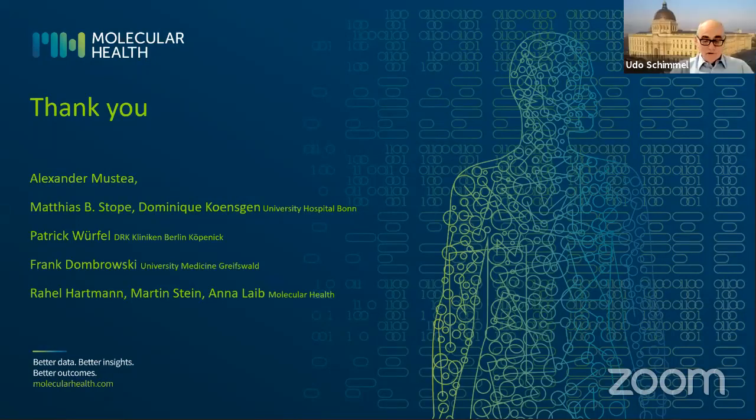Thank you, Ulrike, for your interesting talk and for the insights you gave us. My question is, how can the quality control be standardized across different laboratories according to the needs? You have seen that the quality of the samples has a large effect on the analysis of the data and the stratification afterwards. So how can we ensure that the quality is similar?